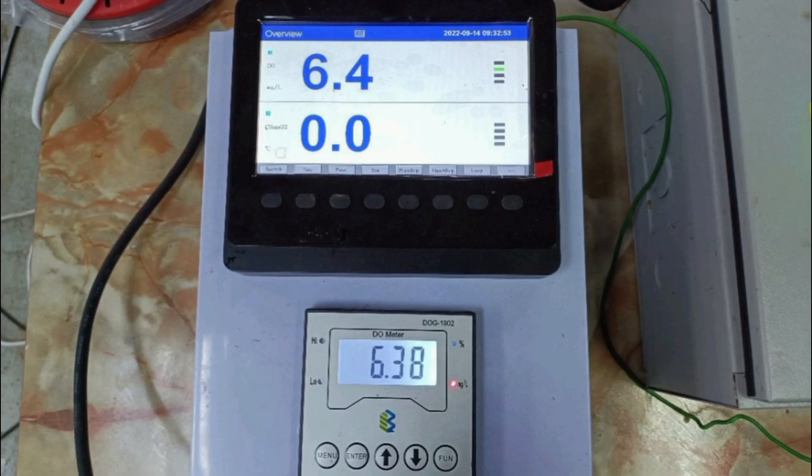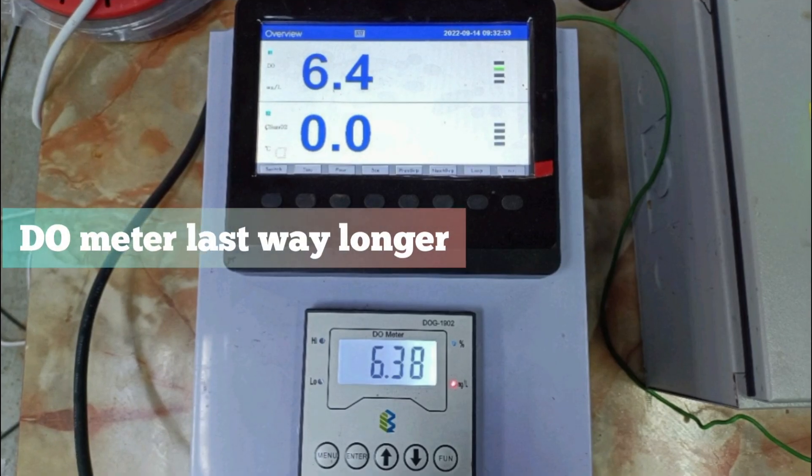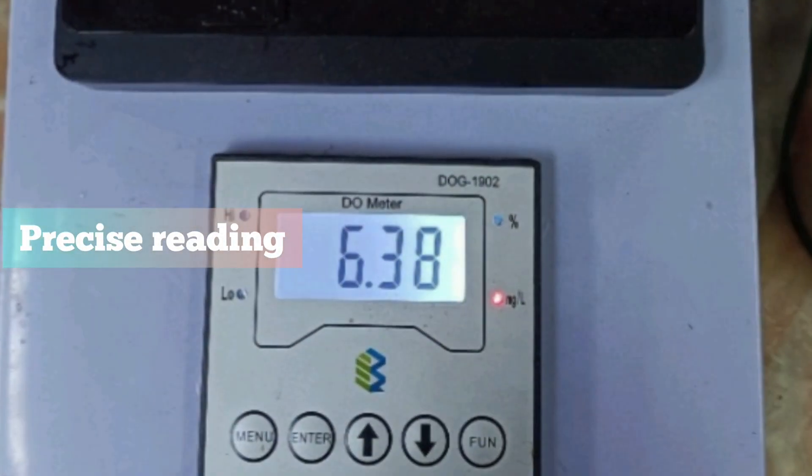If used properly, this can last for years and we won't have to worry about replacing it. It also provides a more accurate reading and saves us time from manually checking the DO level.